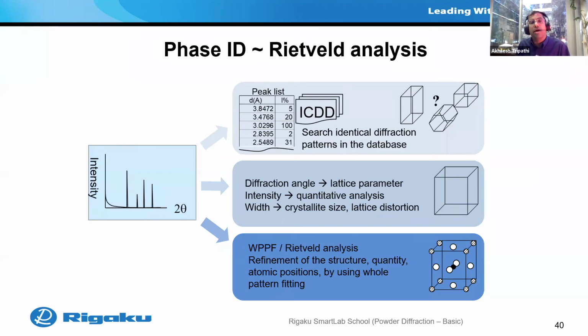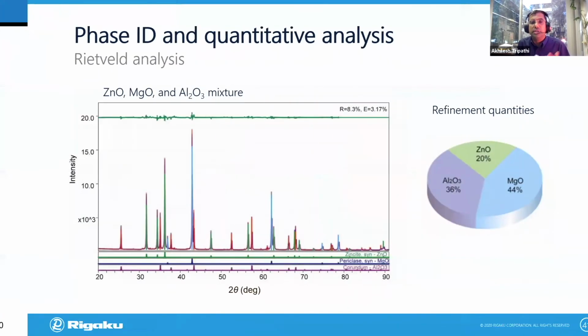In the most advanced part, one can do Rietveld analysis or whole pattern powder fitting. Herein, people are studying in depth if they are doing atomic substitution. I will bring in one example to elucidate this point: if you are changing an existing element with another element to change the properties. Like I mentioned before, crystal structure and property are two sides of a coin. If you change one, the other side has to change to reflect the consequent change in the property. You can do other techniques too.